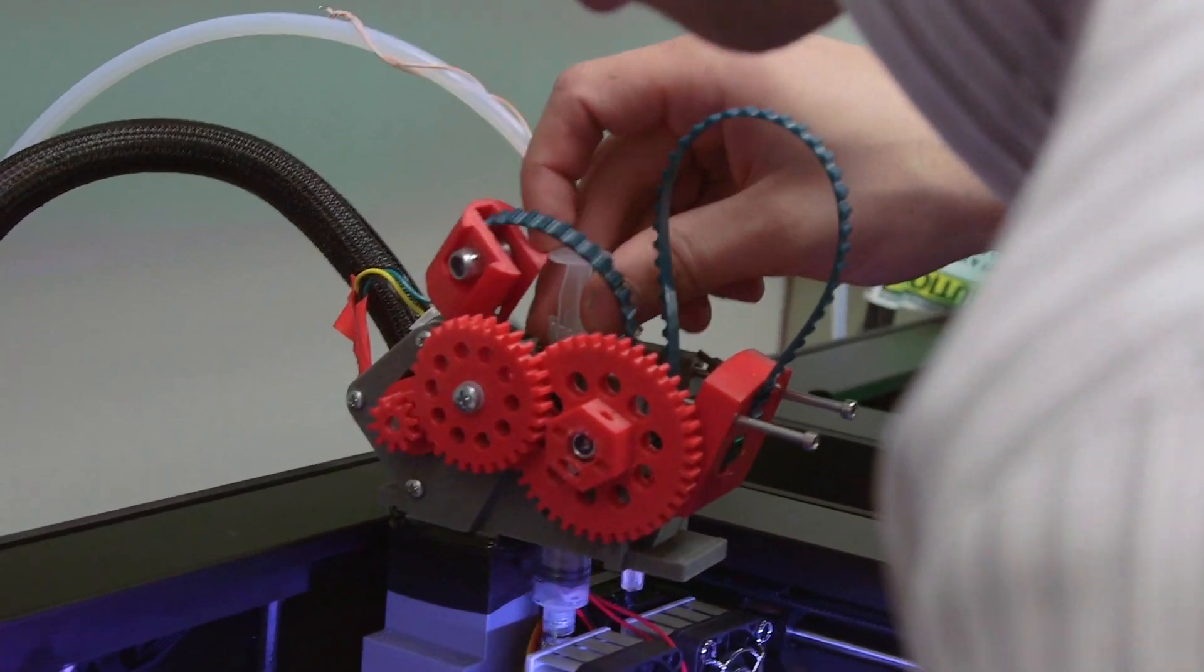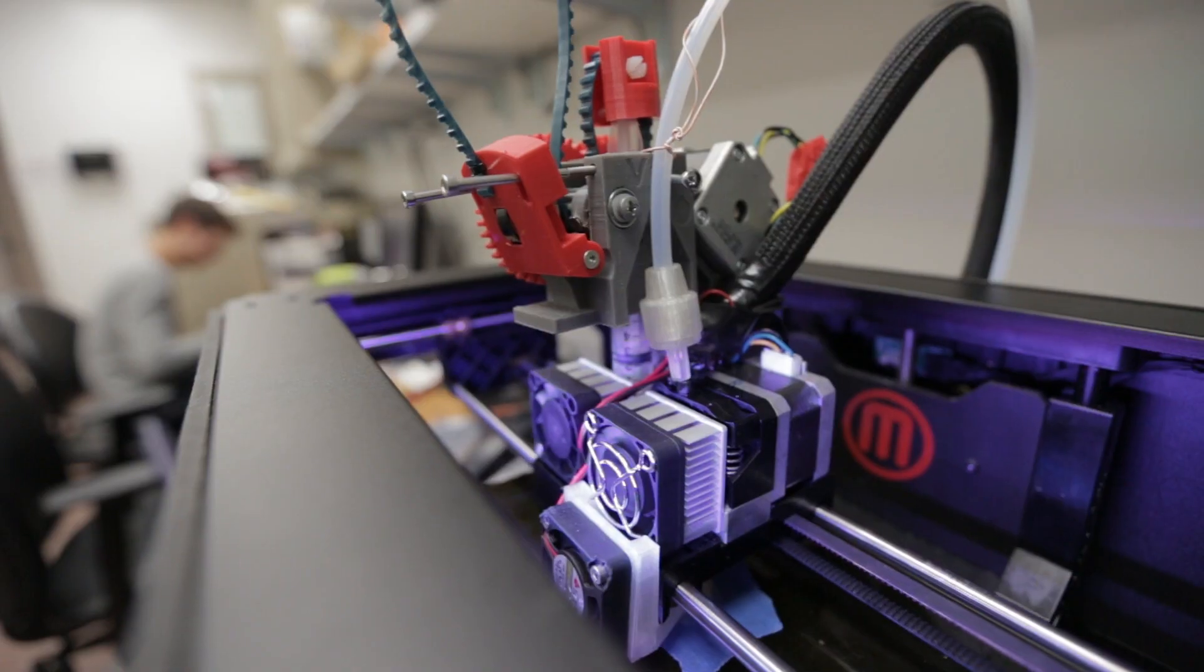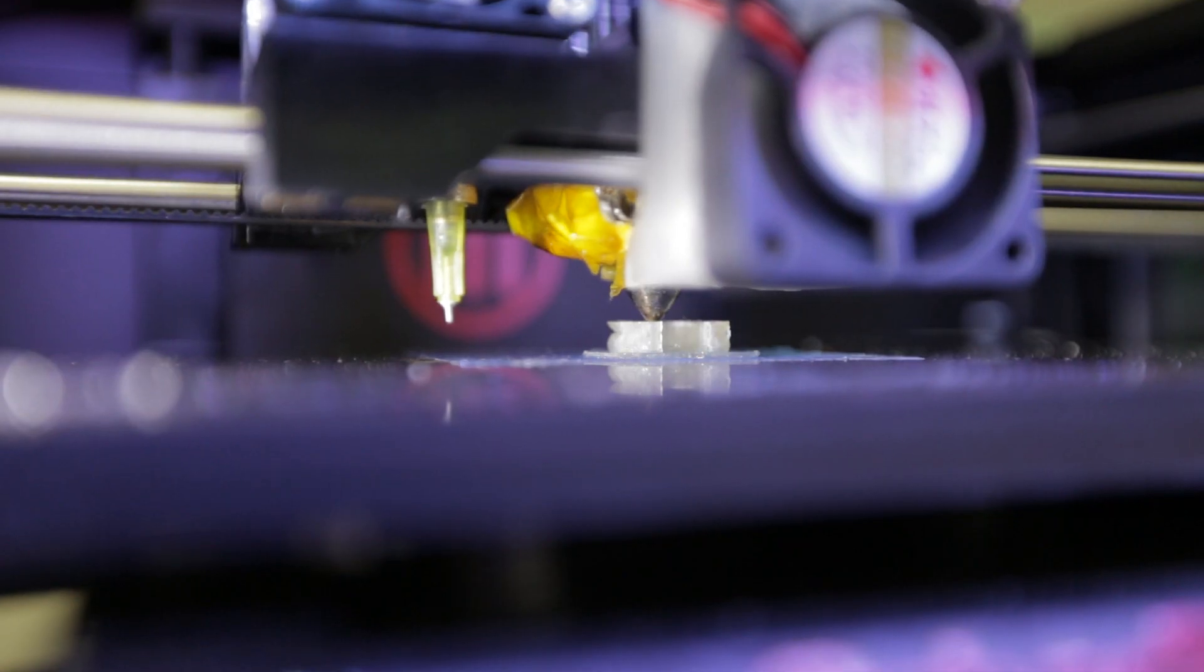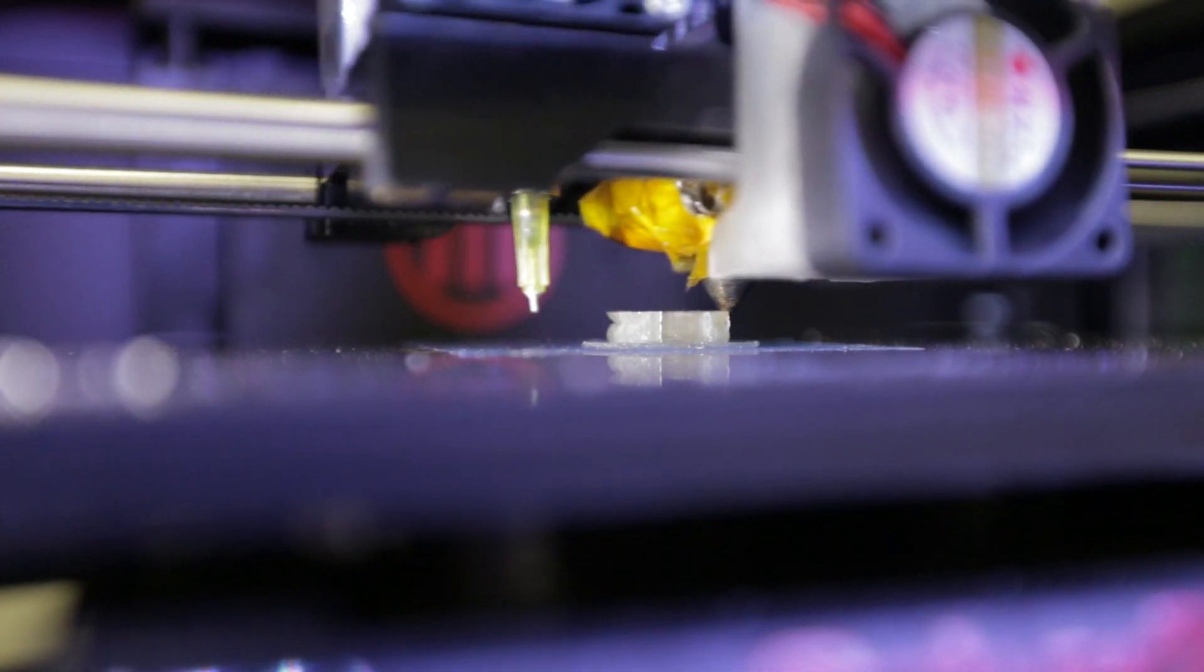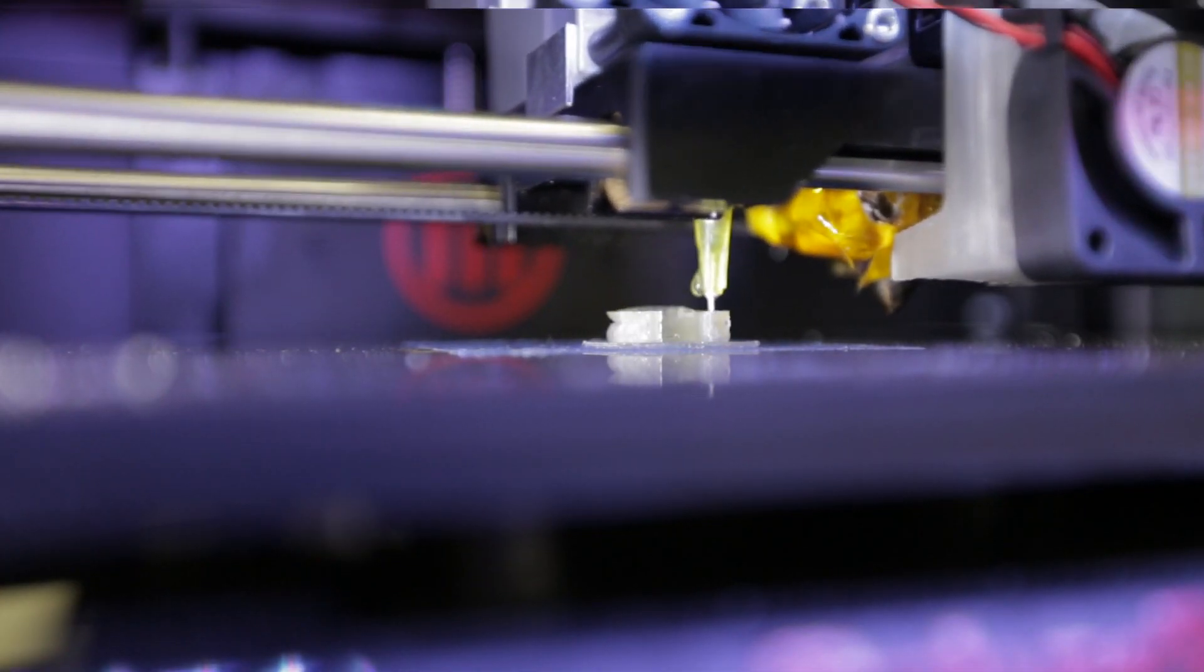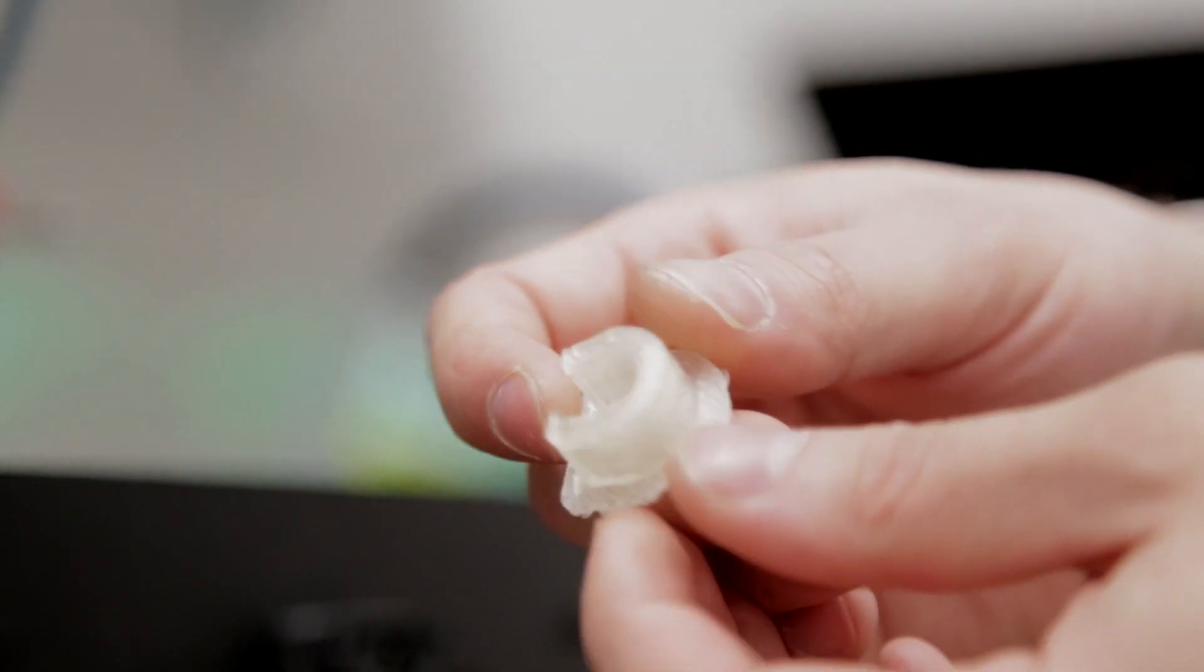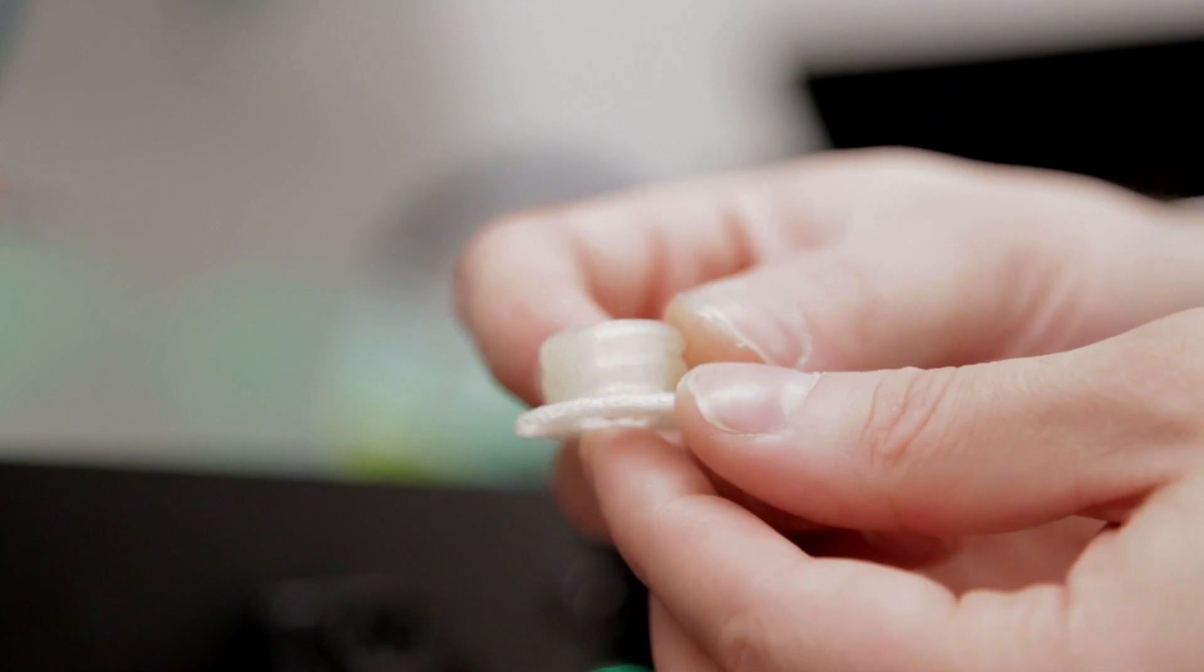A lot of this is the universal paste extruder, which you can go on Thingiverse and download. So the way it works is it'll put down a couple layers of PLA, which are the structure, the scaffolding. And it'll then inject the cells into the void space that it created. And when we remove it, you have no more void spaces. You have the PLA and the gel making it one solid unit.